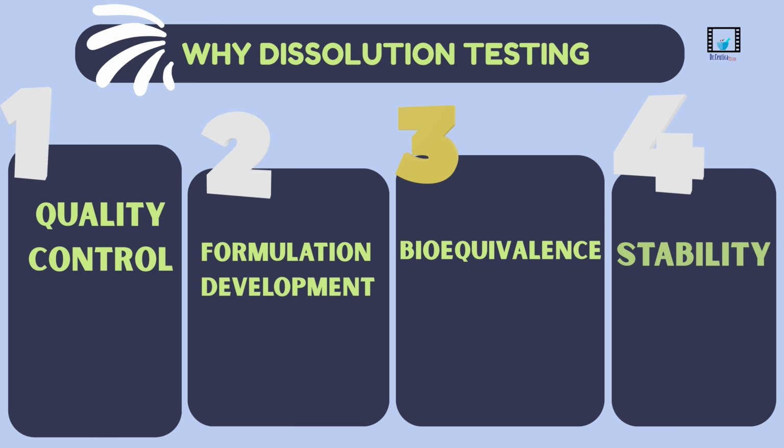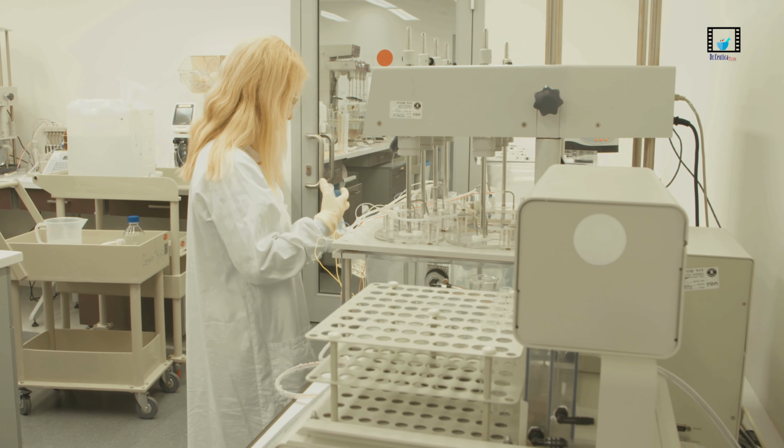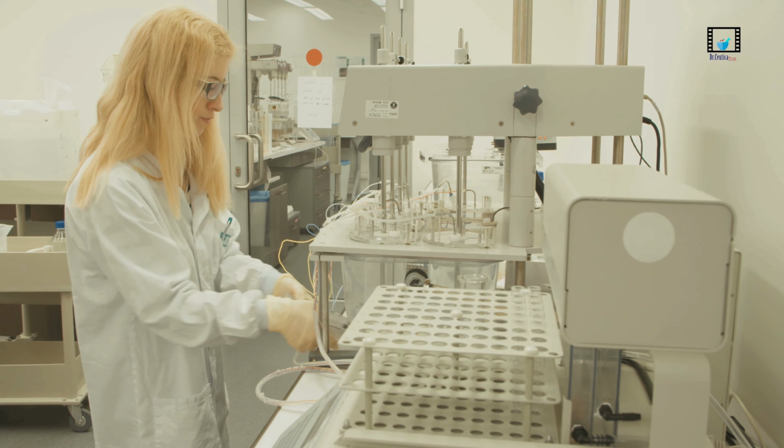And finally, there's stability. Over time, different factors can quietly alter a formulation. By tracking dissolution, we catch those changes before patients ever do.